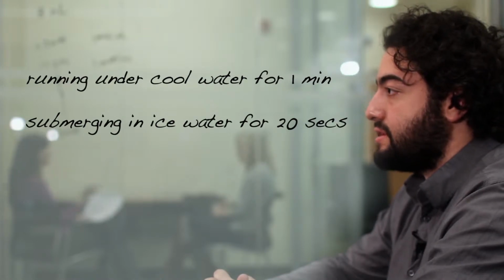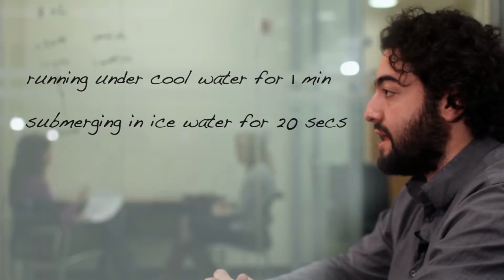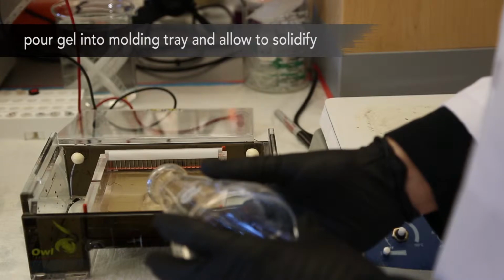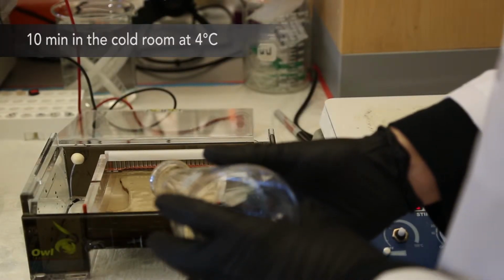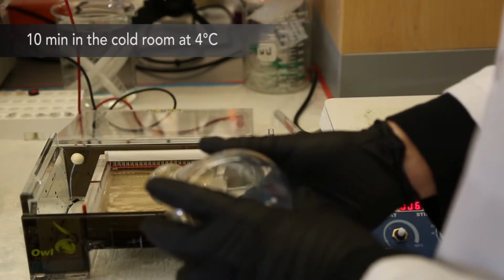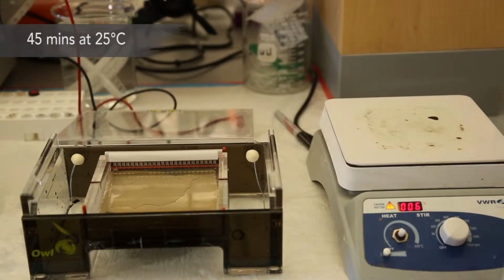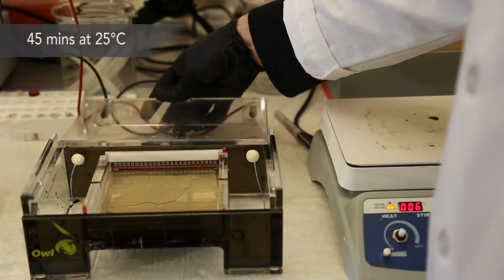Ensure that you swirl the contents while doing this so that the liquid does not gel at the walls of the flask. Pour the gel into a molding tray with a gel comb containing at least 13 wells and allow this to solidify. We find that pouring the gel in the cold room at 4 degrees C helps expedite the gelling process. 10 minutes in the cold room should be ample time. At 25 C, the gel should be allowed to sit for at least 45 minutes to solidify.